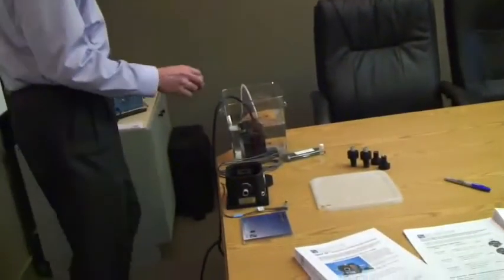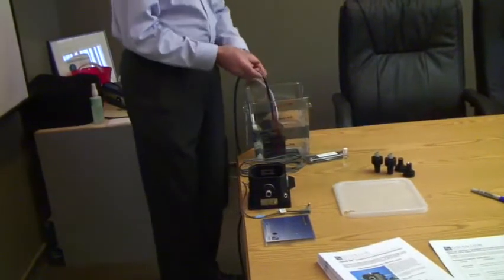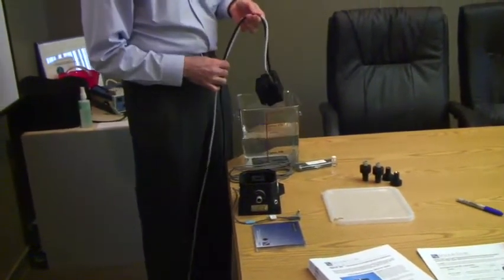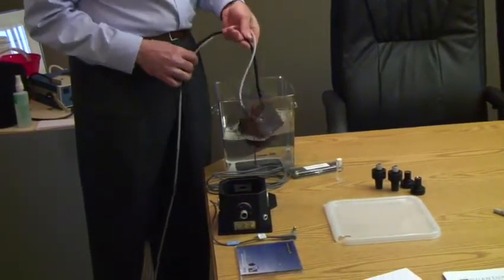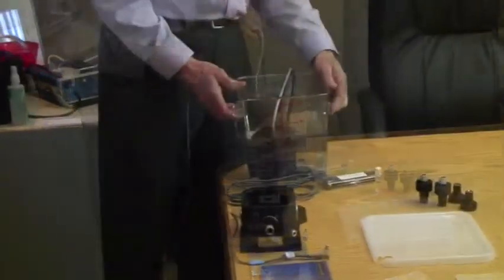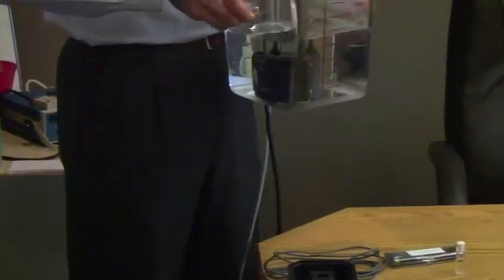What we do is we provide with every package our Bath 100, we call it. And all it is is a robust aquarium pump. We also provide the bucket that comes along with it, and that is the water that's going to circulate through it.